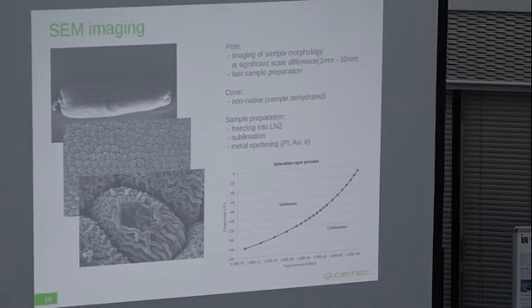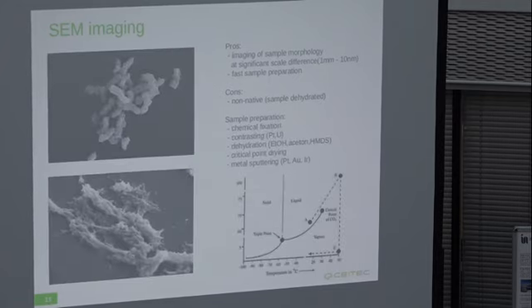During the time, if you leave the sample in the SEM, the water will condense on the sample and contaminate it, specifically in microscopes with large chambers. However, if we manage to raise the temperature to the sublimation region, we can sublime out most of the water. Then we can sputter the surface again with metal to increase the conductivity of the sample and improve the imaging.